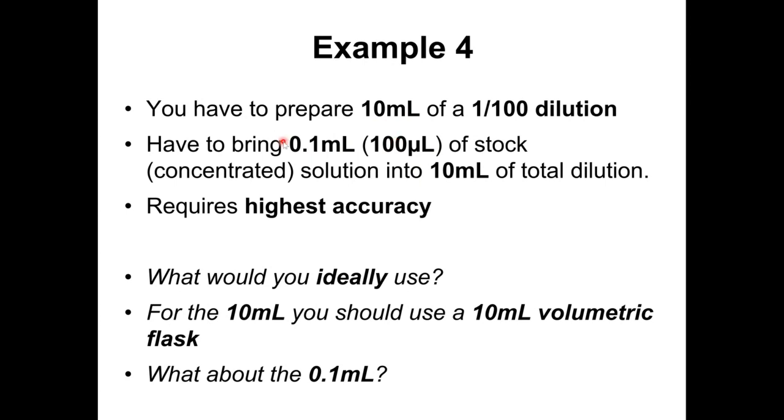So you would take 0.1 milliliters of this stock solution, you would transfer to a container that allows you to measure 10 milliliters, and you will bring the volume to 10 milliliters. We'll talk about that when we do the dilution. Well, this, obviously, you gotta prepare a dilution, which is a solution. You gotta be as accurate as possible.